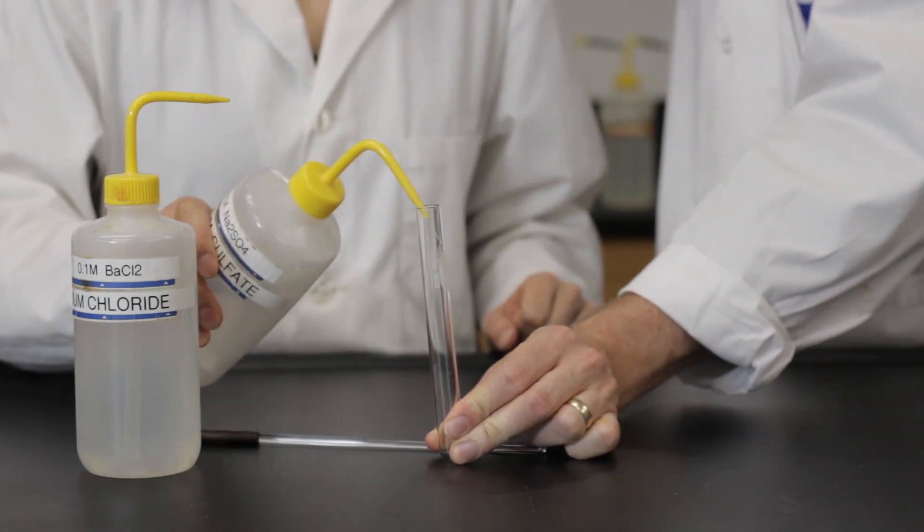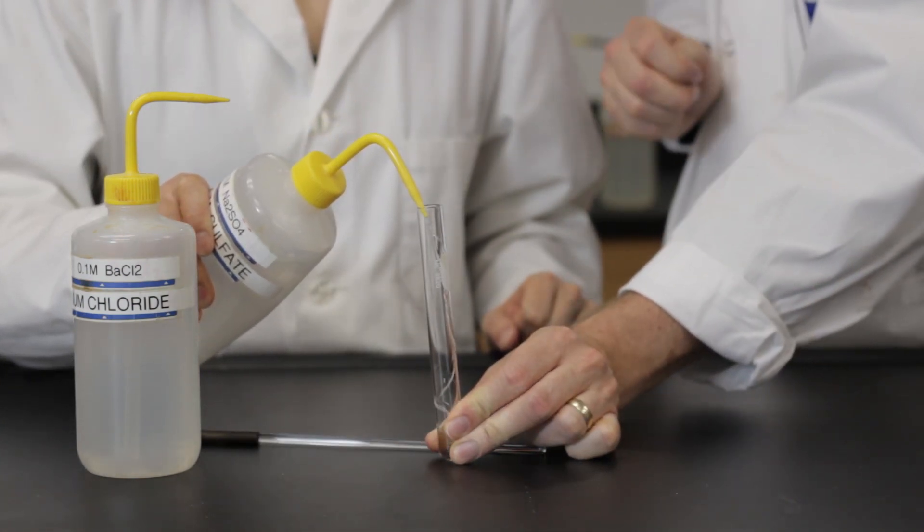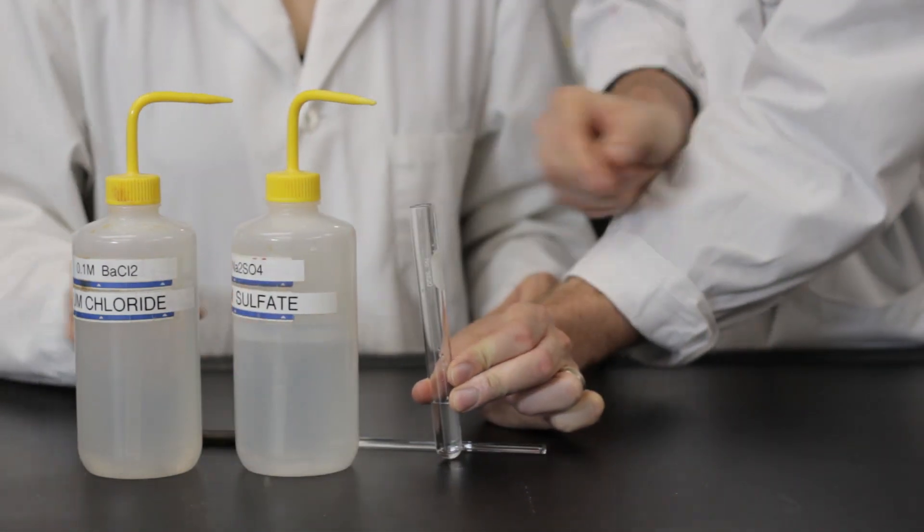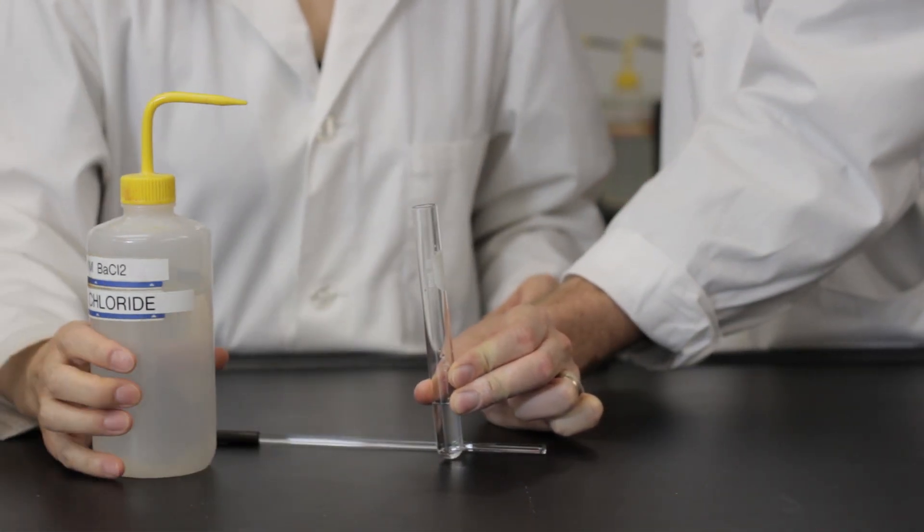For double replacement reactions, in the test tube, mix 2 milliliters of each solution. Again, you can use your fingers to measure the volume.